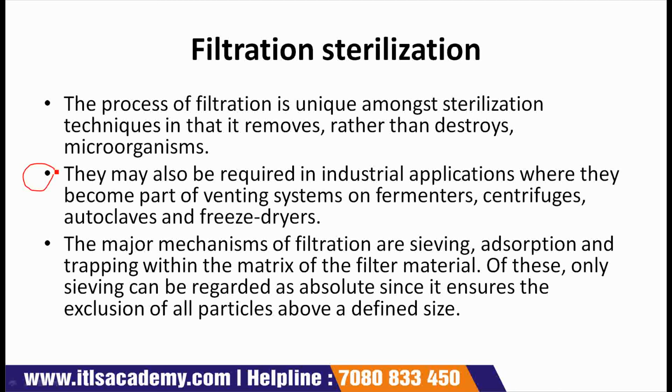Next point, they may also be required in industrial applications where they become part of venting systems. And this venting system is present on fermenters, centrifuges, autoclaves, and freeze dryers. These filters are then placed on the surface of a solid nutrient medium and incubated to encourage colony development.